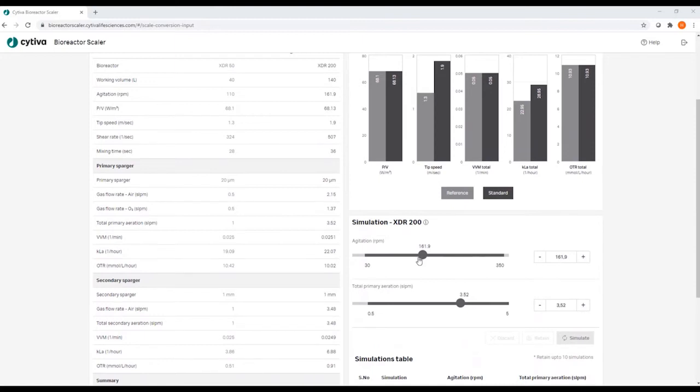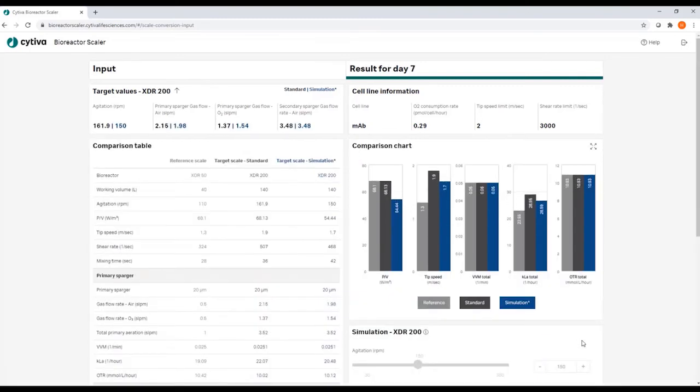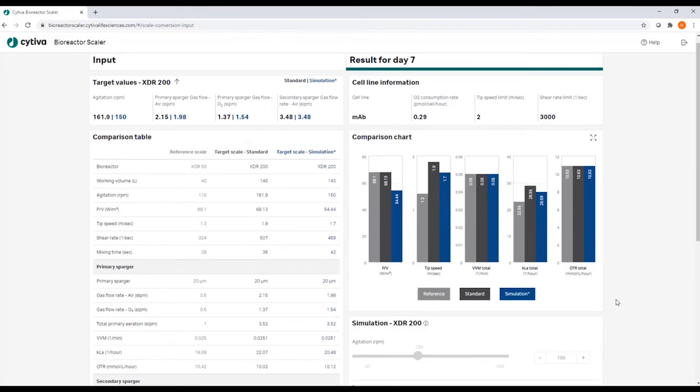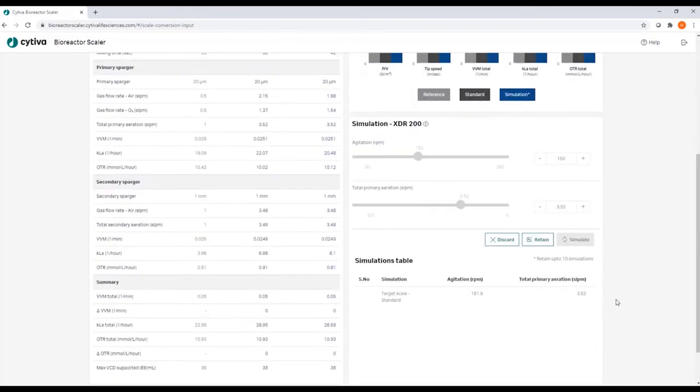You can manipulate certain parameters like the agitation using the sliders and start a new calculation, which will generate a third set of bars in the comparison chart, but also a third set of parameters in the comparison table, which give you more in-depth information.